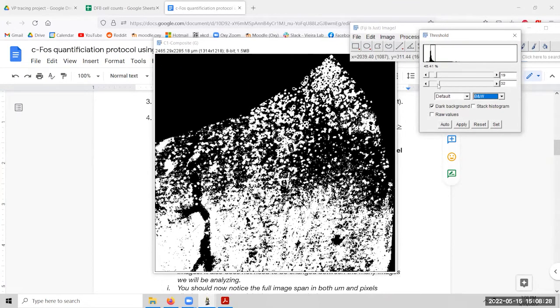This basically cuts out the brightest parts of the picture. So anything that is super bright is cut out at 255. Anything that's moderately bright is cut out at 128. And up until we get to this point, it starts cutting out the brightest parts inside the particles. That's why there are all these holes that start showing up. So we're not going to mess around with the maximum though. That seems fine as it is.